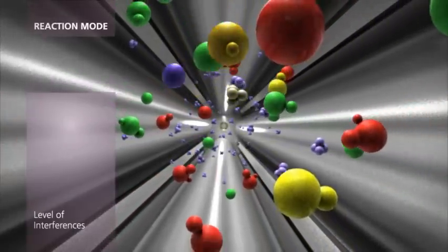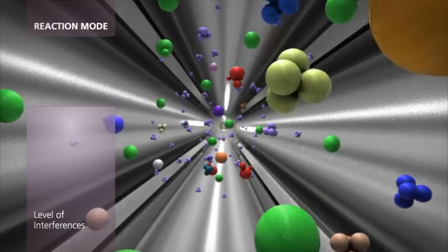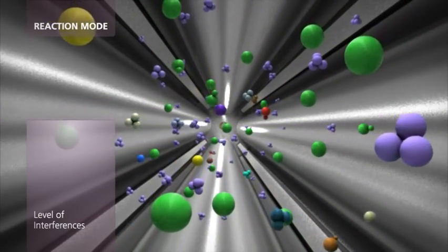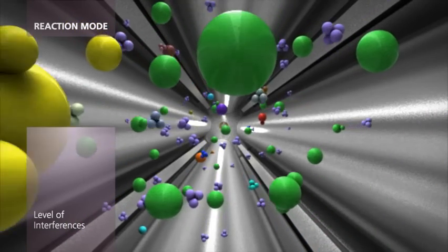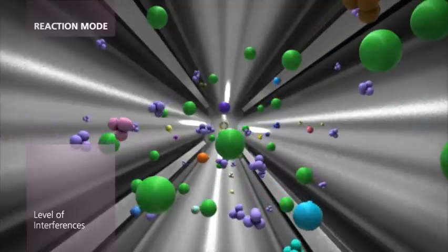Using a highly reactive gas, interferences are specifically targeted and removed through chemical reactions. When running as a dynamic reaction cell, a scanning quadrupole minimizes the formation of new polyatomic interferences while retaining analyte sensitivity.